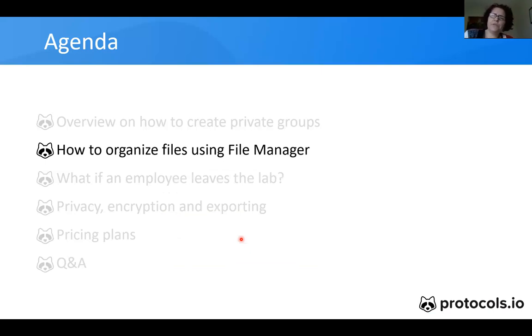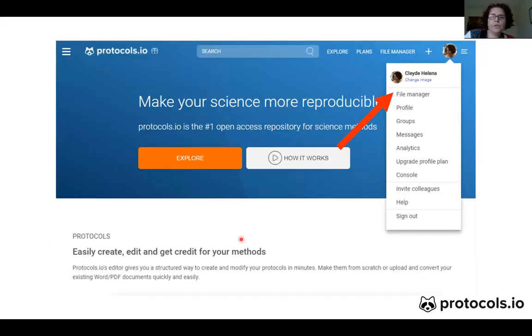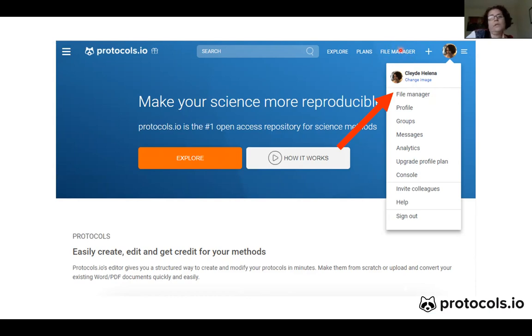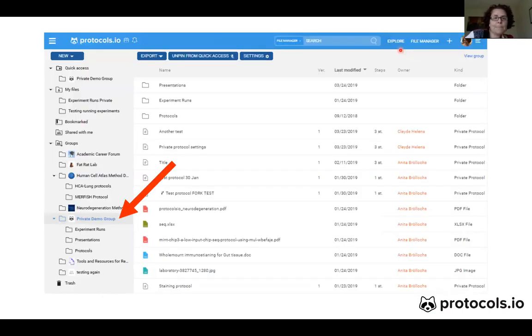How to organize files using the file manager. You can access the file manager through two ways: either you can click on your profile page where there is a link, or there is also another link directly on the homepage. This is the file manager and how it looks.